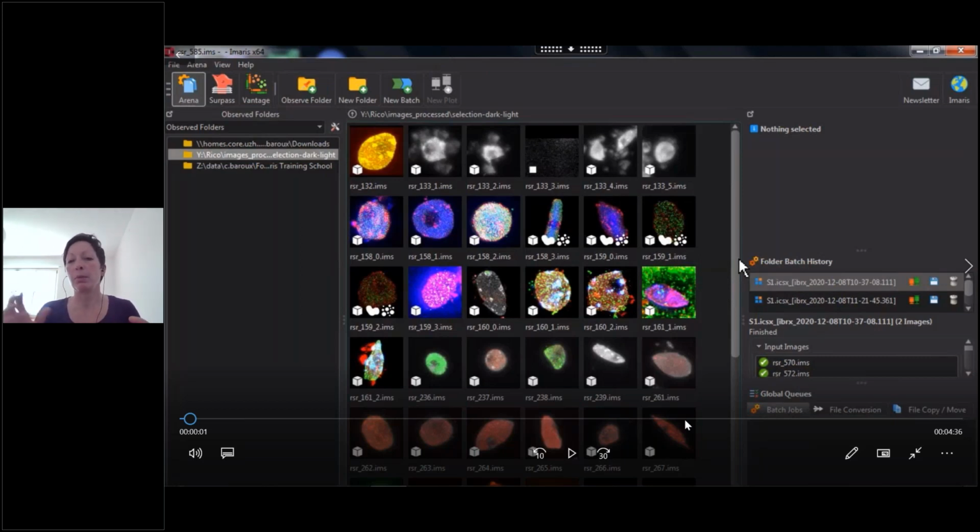Here you combine the analysis of the size of the domains, the number of domains, and the position, but you don't have this radial relationship anymore. But these are categorical organizations which I presented more as a scheme for thinking about it, but you can actually combine everything in terms of analysis. I just wanted to present some simple cases. Does it answer the question?